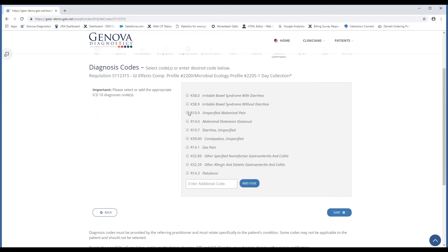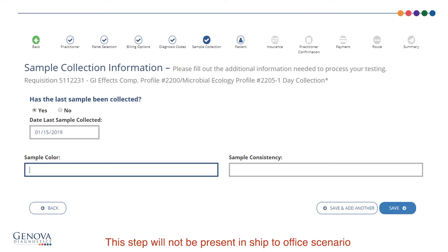The diagnosis codes page lets the clinician select the appropriate ICD-10 code for the specific test and patient. We have pre-populated codes based on historic usage, but also allow clinicians to enter codes at the bottom of the list. On the sample collection information screen, you can notate if the last sample has been collected. If you select yes, you will be asked to provide the collection date and specifics about the sample. If you'd like to add another requisition for the patient, click Save and Add Another, or proceed to the patient information step by clicking Save.